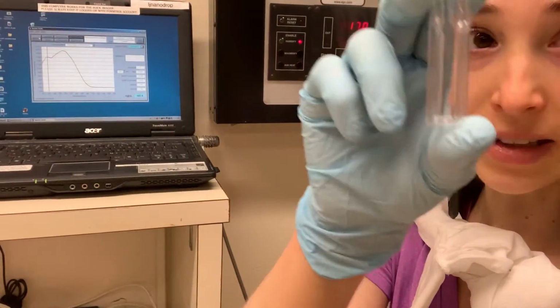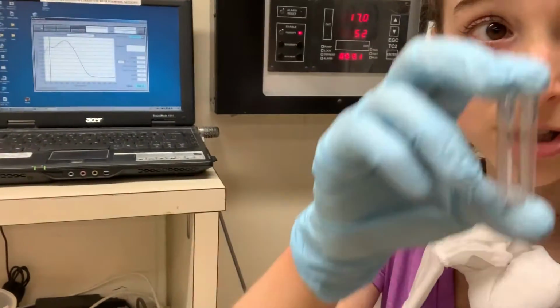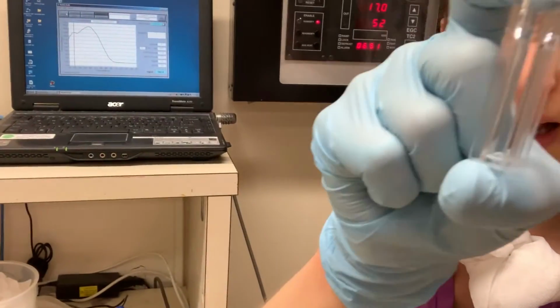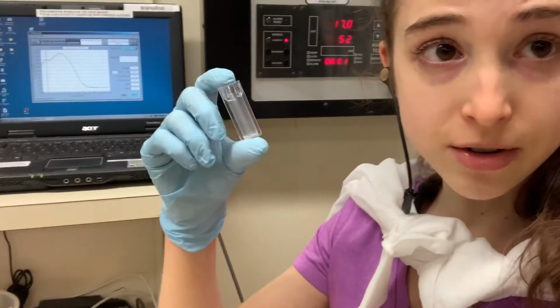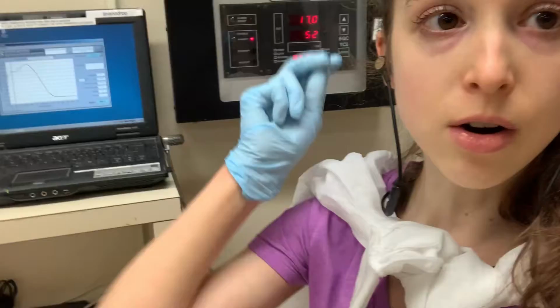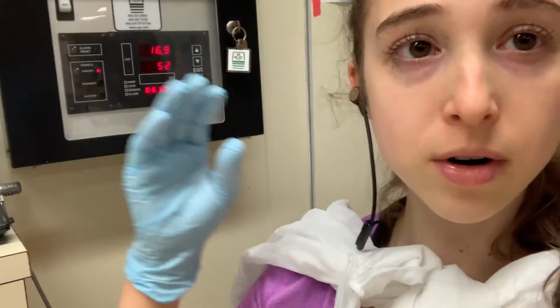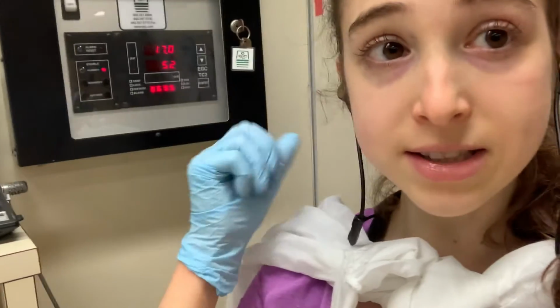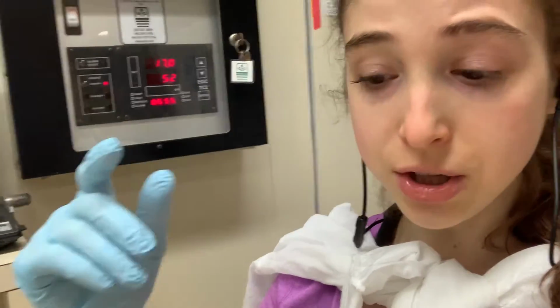With a Nanodrop, you have a tiny little column, so you don't have to use very much sample, but it's the same principle as with the cuvette. You're shining light through, and then you're measuring how much light makes it through. Not all the light's going to make it through, because some of the DNA and RNA are going to absorb some of the light. The more DNA or RNA molecules we have, the more light's going to be absorbed, and so Beer's law allows us to go directly between the two.